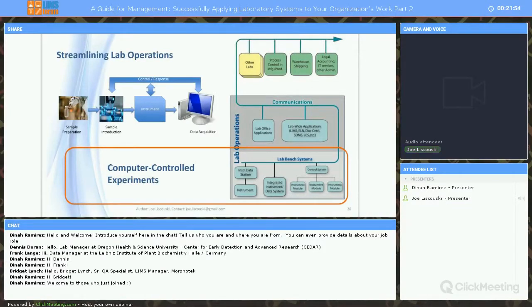First, the new system would have to be revalidated, and any new components would have to be qualified for use. Second, it would also have to be tested against the older implementation to determine if there are any changes in the process or the results. These are just 2 points of concern.